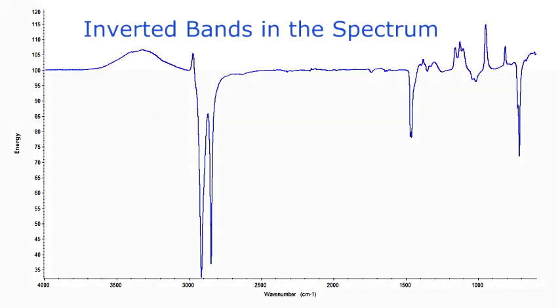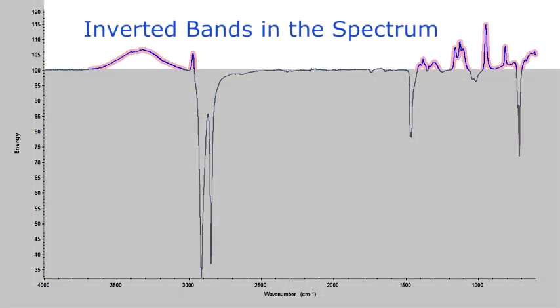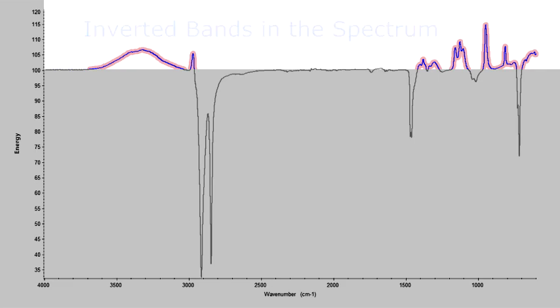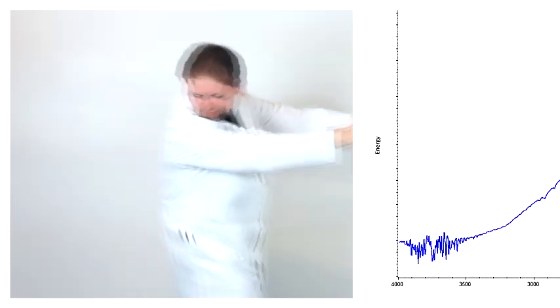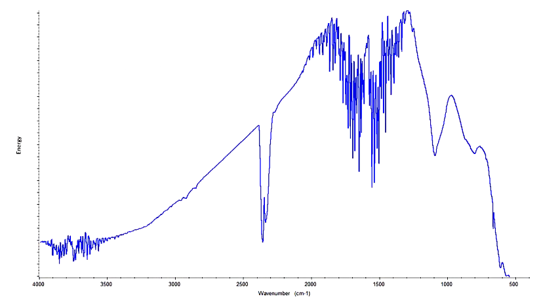When you have inverted absorption bands in a spectrum collected using ATR, the single beam spectrum is the first place to look when searching for the cause. We'll start with the single beam of the instrument with an empty sample compartment to understand the instrument's spectral features.